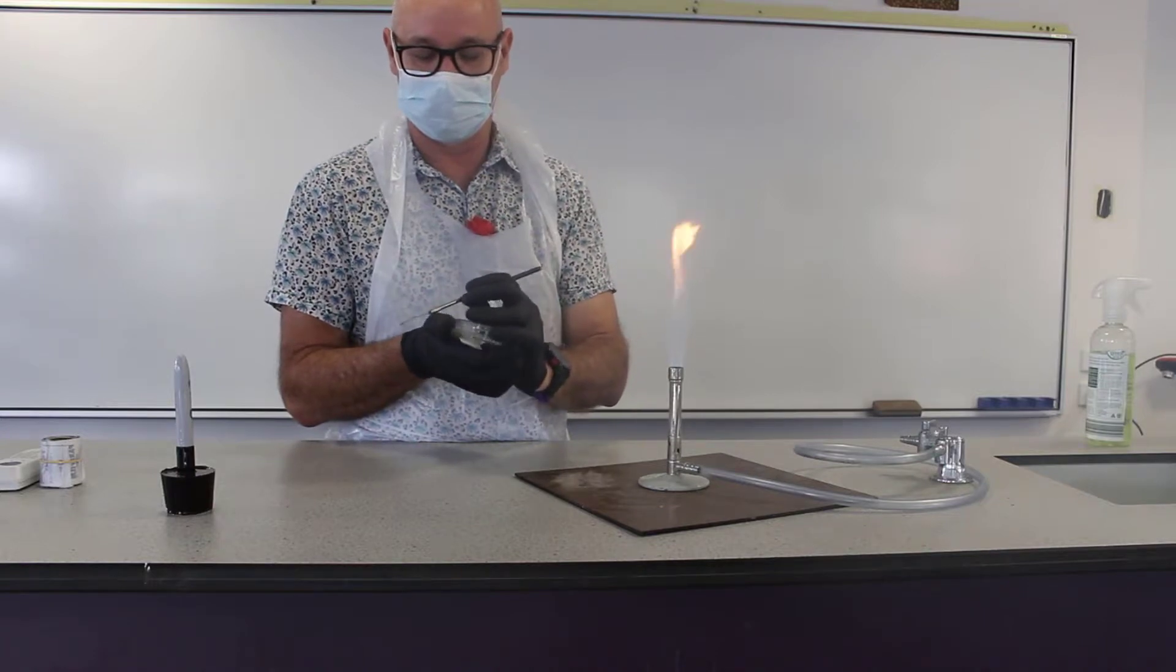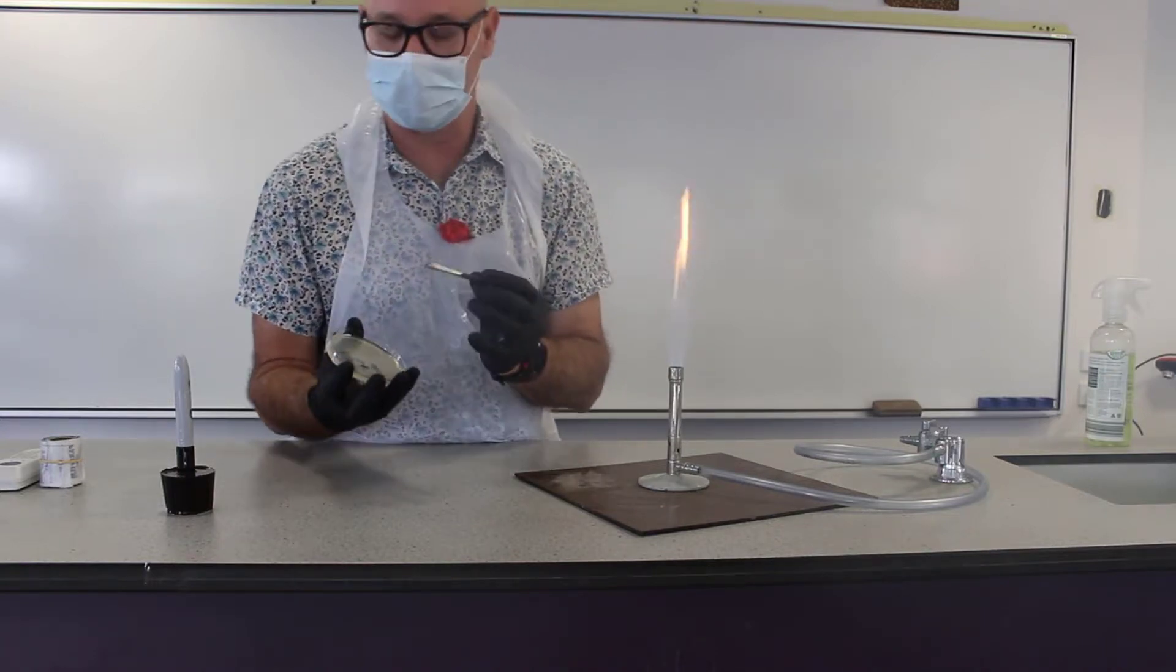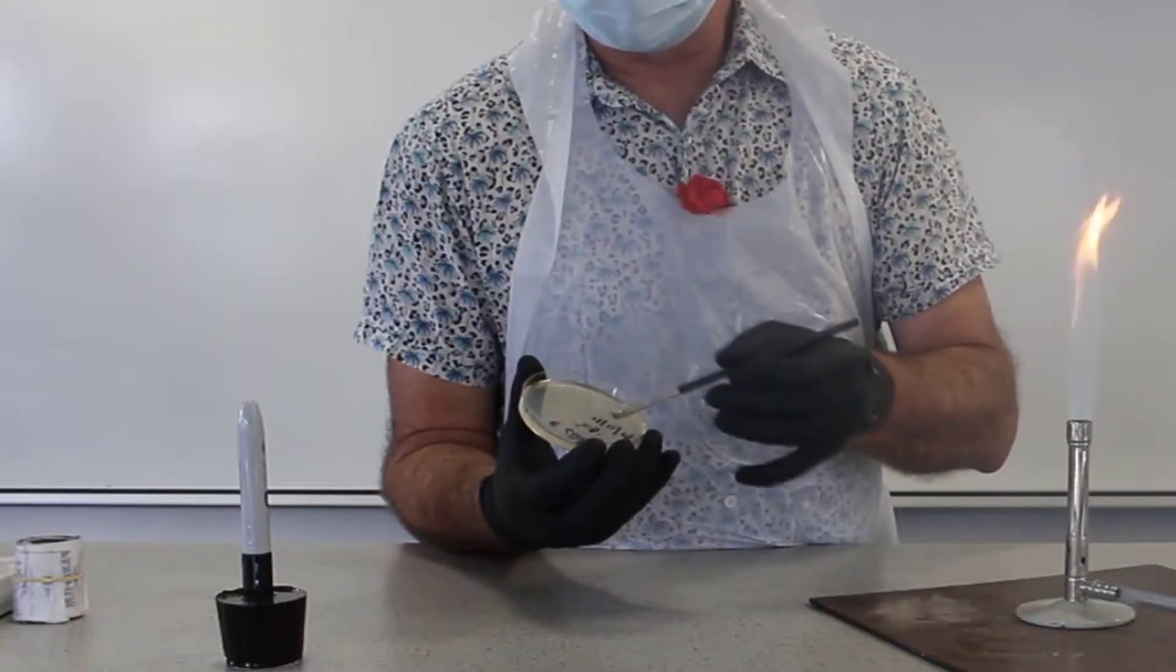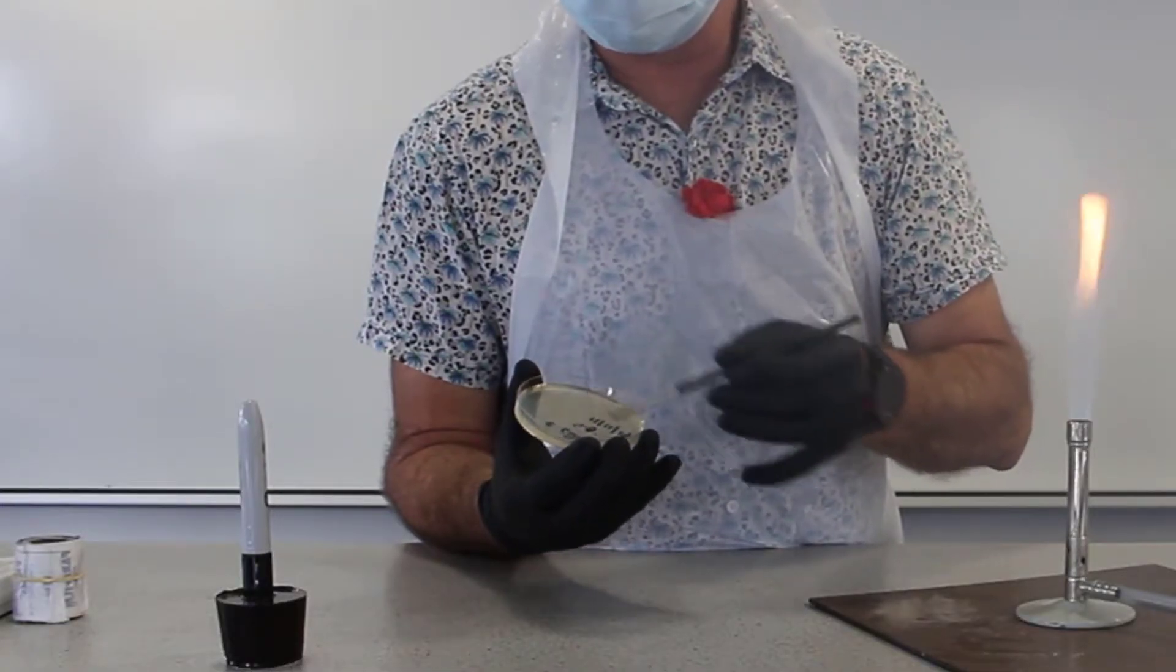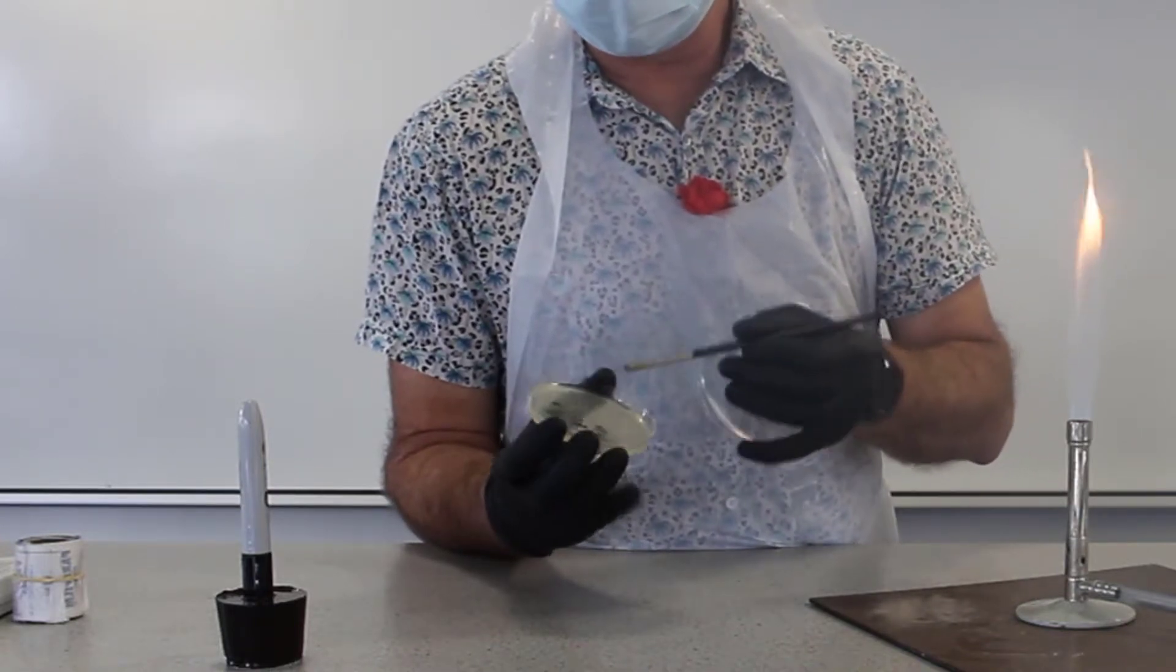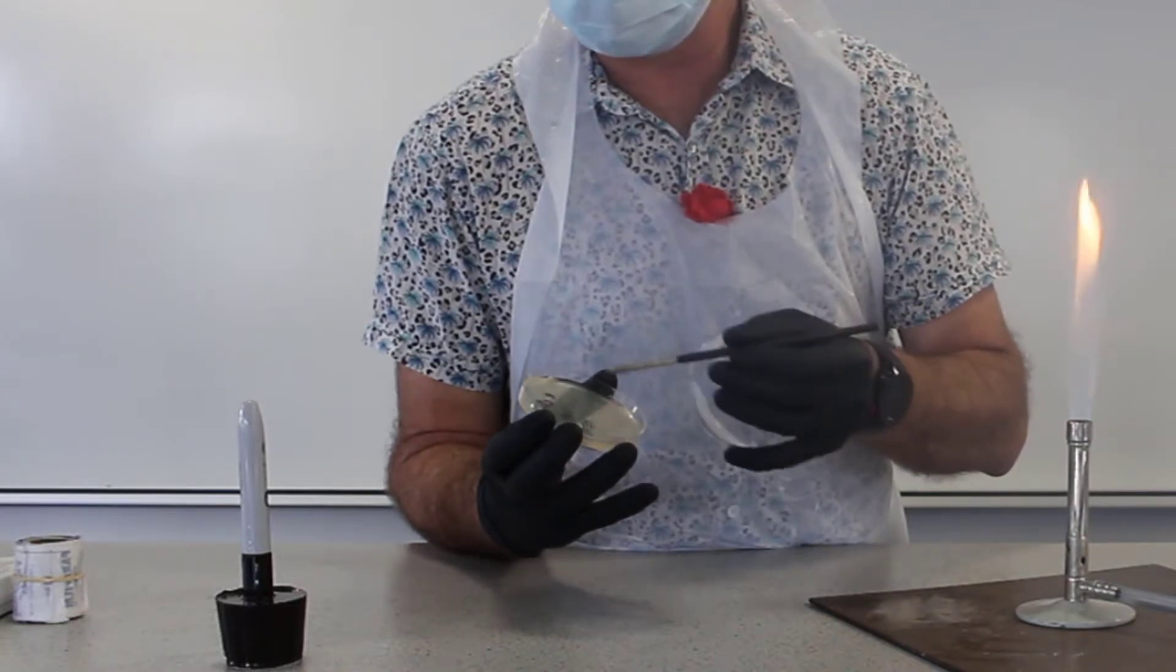What we're going to do is a 16-streak dilution. Firstly we want to in one section here spread the primary inoculant and then we're going to do 16 streaks across the plate.